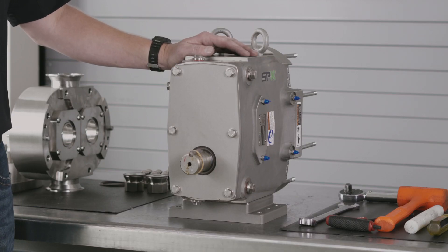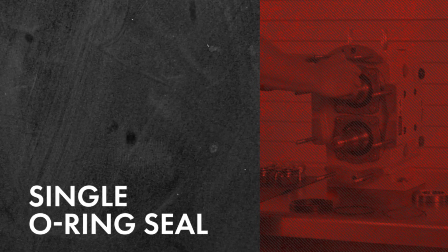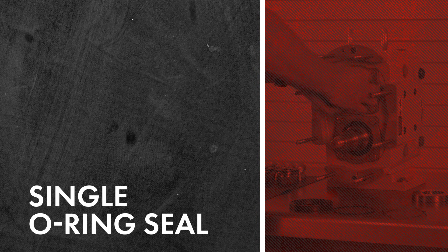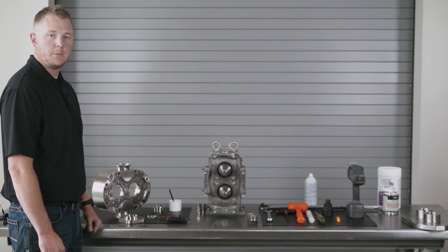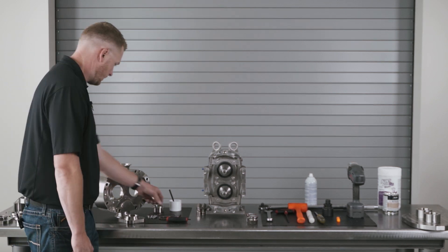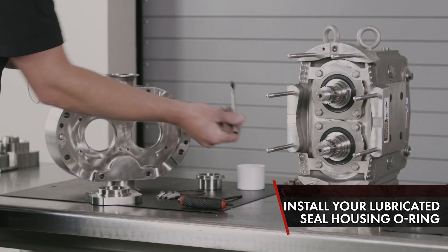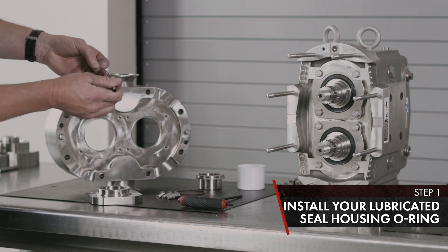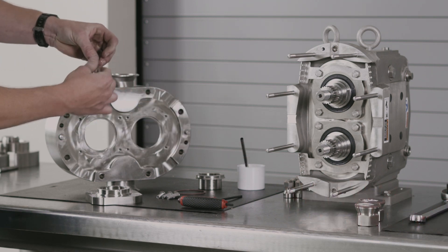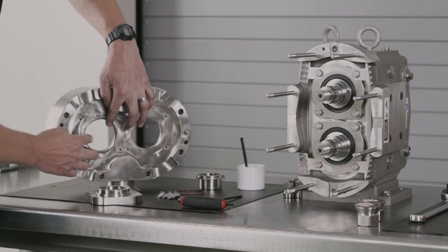That concludes the gear case assembly inspection on the Waukesha Universal 3 PD pump. Now we're going to go over the single O-ring seal on a Universal 3 PD pump. First, take your seal housing O-ring and the silicone-based lubricant, apply to the sealing surface and the O-ring. Once the O-ring is lubricated, install into position.